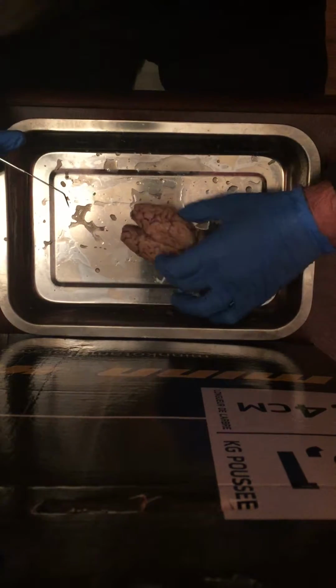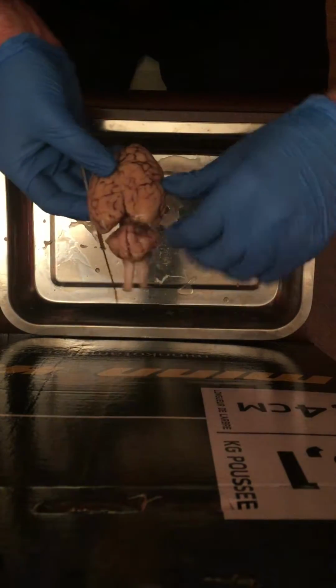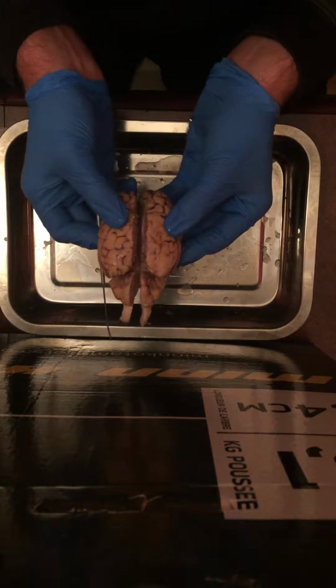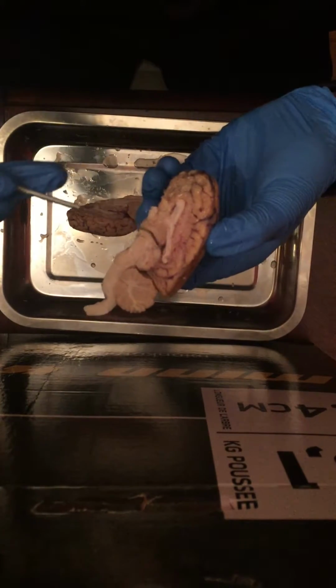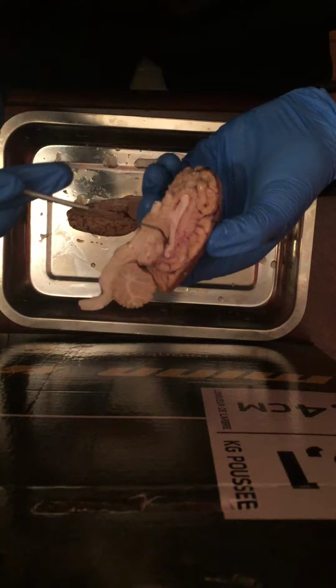Next we have the corpus callosum. When the brain is together and we hold it like this, barely spread apart, we can see it, but if you look closely here, this is also the corpus callosum, just split apart. The top part of this is the corpus callosum.